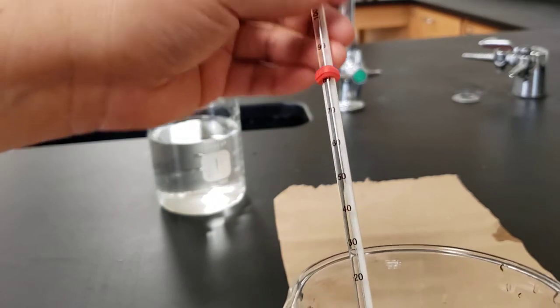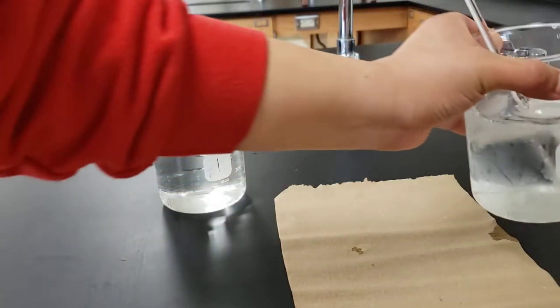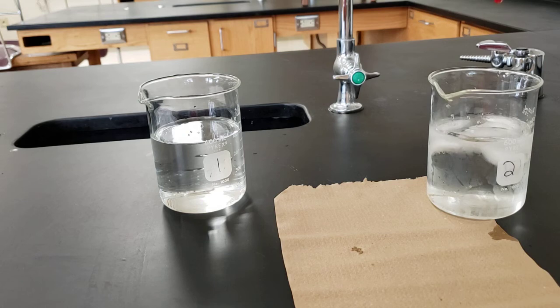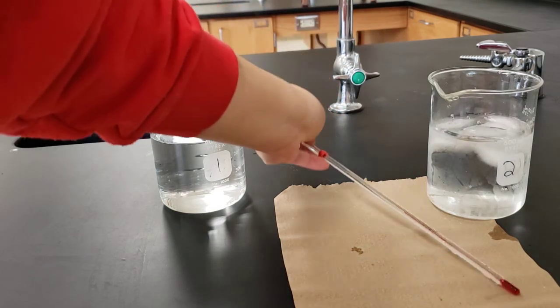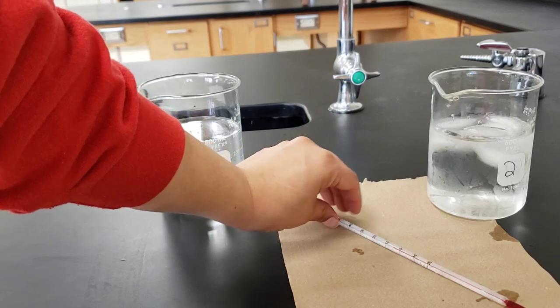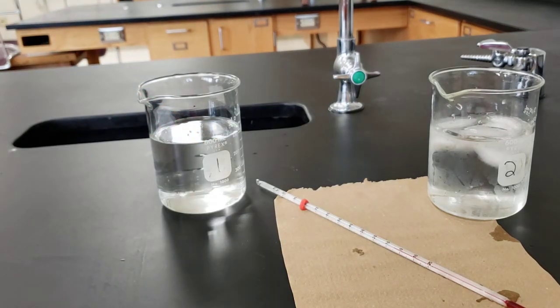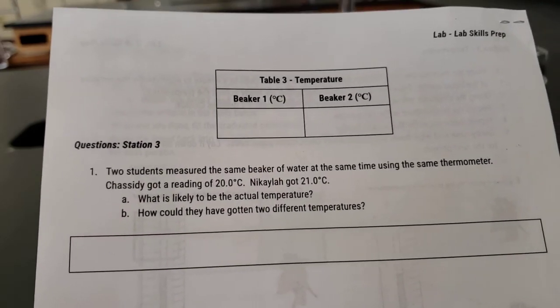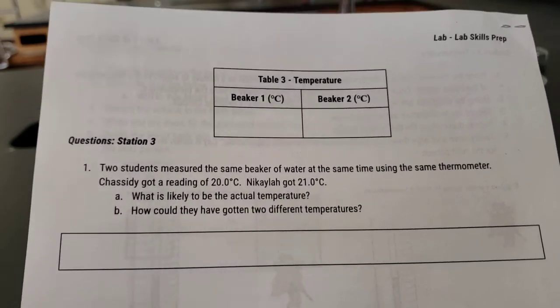All right, folks, that's it for that last station. Anytime you are using thermometers in the lab, it's super important that you remove them from whatever solution you're using them in. This happens to be water, but if it were not water, we would have to rinse this off and then wipe it gently. Then make sure that you read through those 2 questions at the bottom on page 4, and answer them.